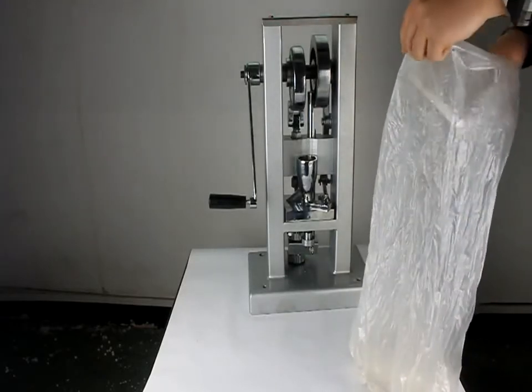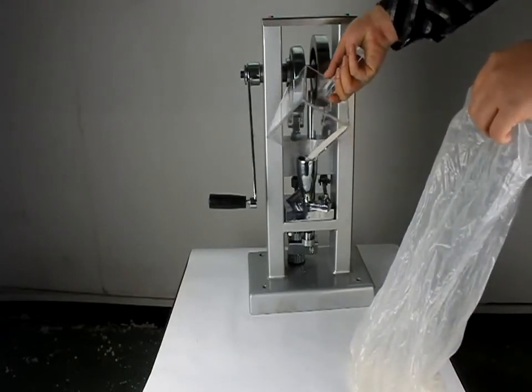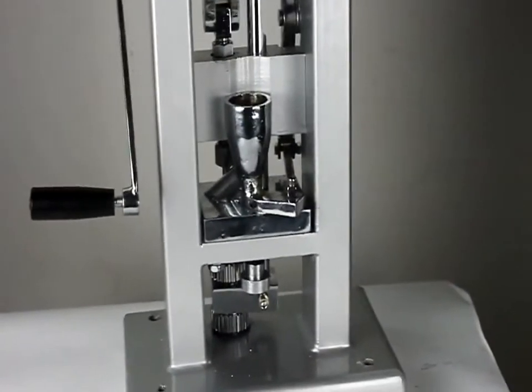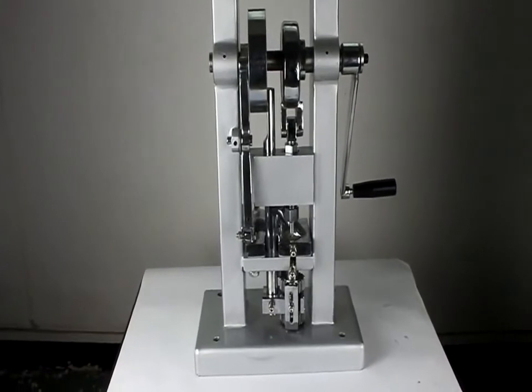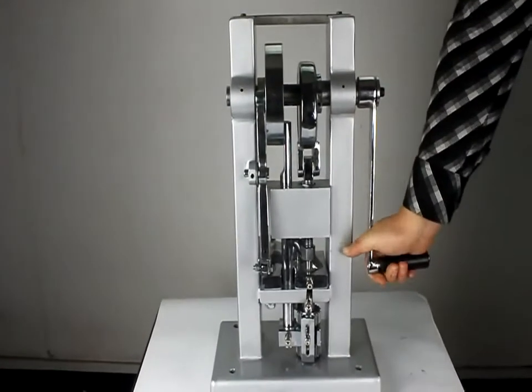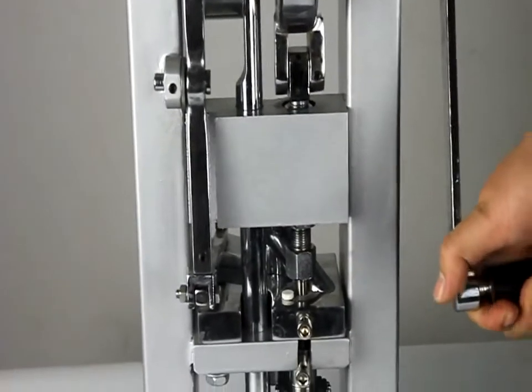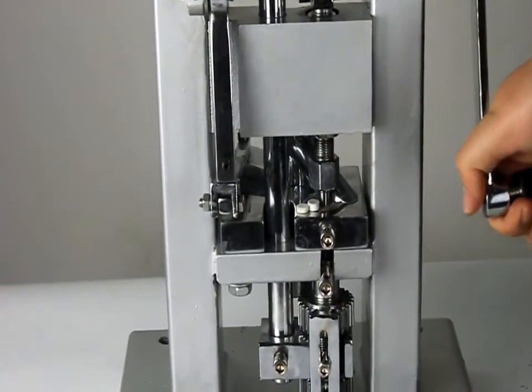Now let's take out the powders into the powder holder. The tape belts come out one by one.